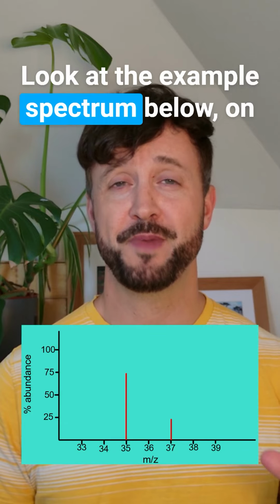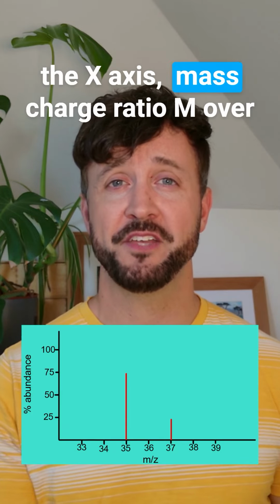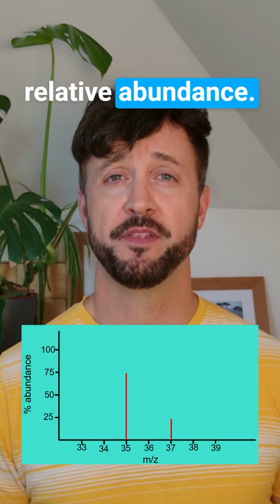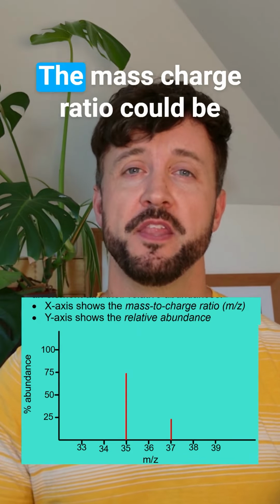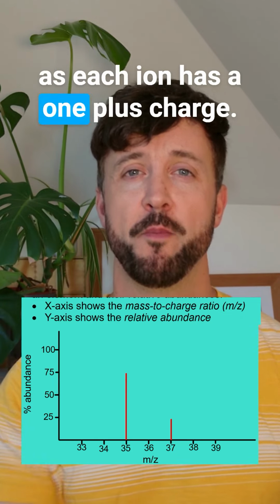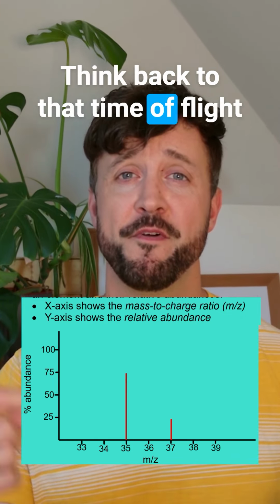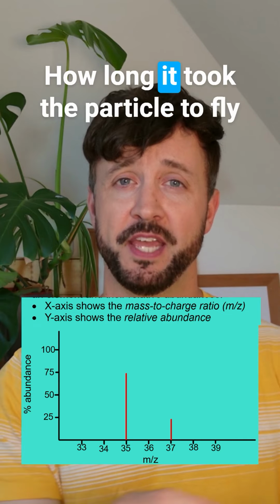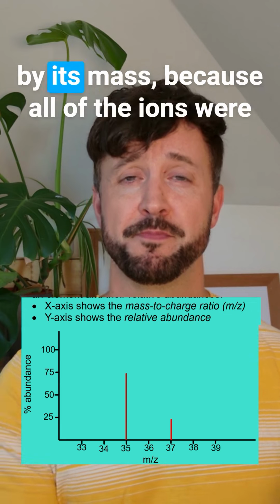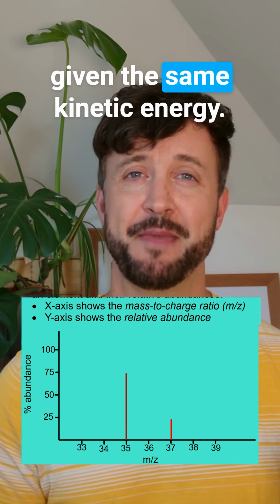Look at the example spectrum below. On the x-axis, mass charge ratio, m/z, and on the y-axis, you've got the relative abundance. What's the x-axis actually showing us? The mass charge ratio could be thought of as the mass of each ion, as each ion has a 1+ charge. Think back to that time of flight spectrometry. How long it took the particle to fly through that flight tube is determined by its mass, because all of the ions were given the same kinetic energy.